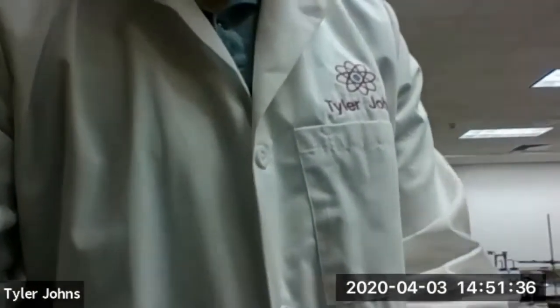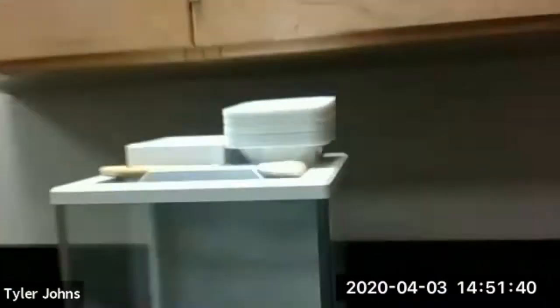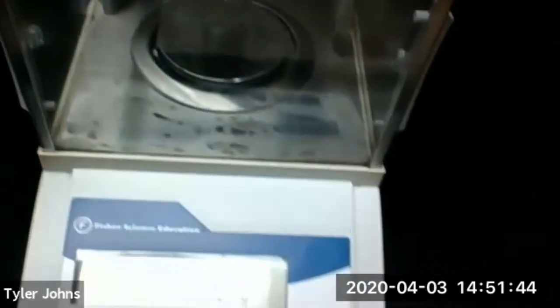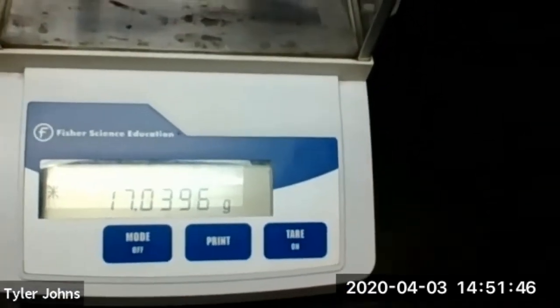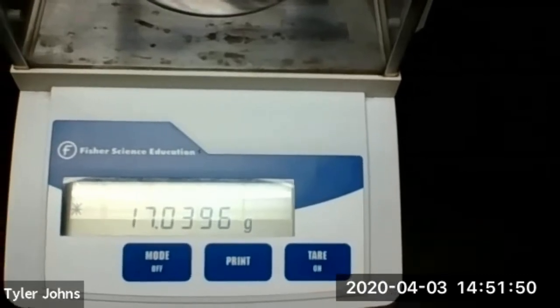Now we're going to weigh our crucible, cover, and magnesium ribbon together. The mass of our crucible, crucible cover, and the magnesium ribbon is 17.0396 grams.